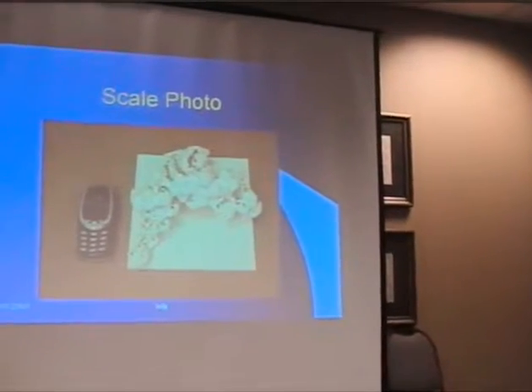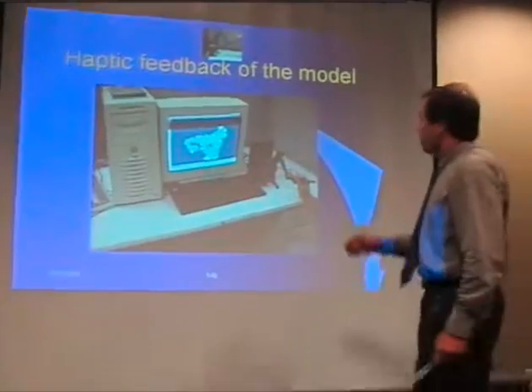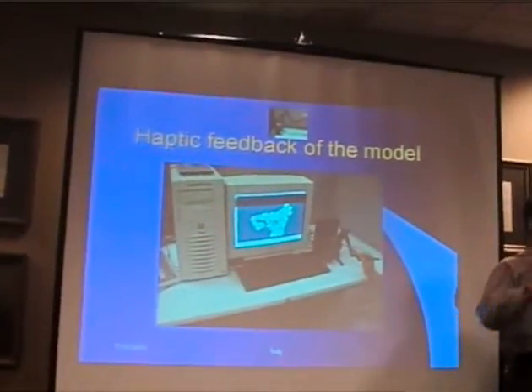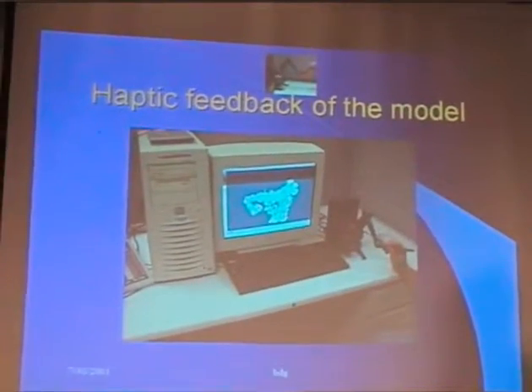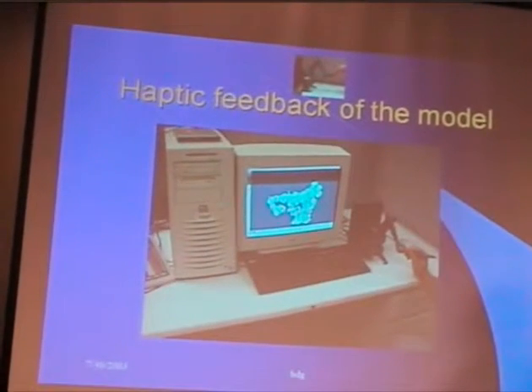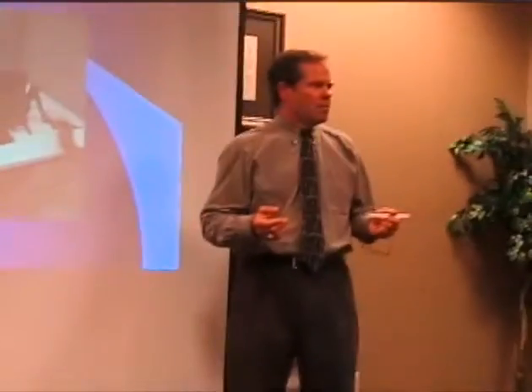Let's see if we have anything else. Yeah, and here's the haptic feedback tool. I didn't get a chance to use it, but the guys who did said you could clearly go over the surface and feel where there was a hole or not. It would be interesting to do this when we have different materials, because then we could code different hardnesses to the different materials and you could get a feel for that. Now, I'm not quite sure how we would use that, at least for the catalyst particles, but anyway, it's sort of a cool thing. It's really a research thing to do.